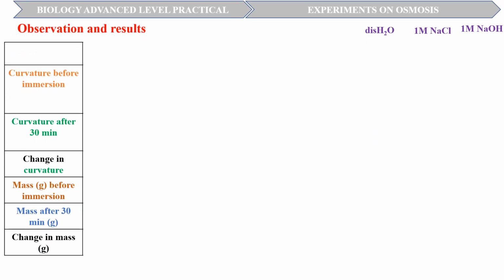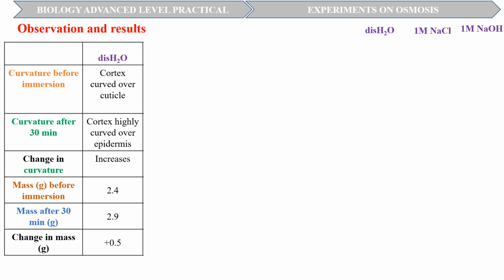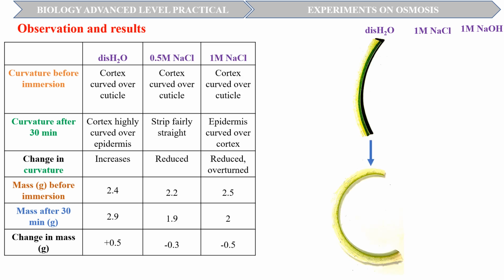The results of the experiment are presented as shown on the table. We saw an increase in curvature of the strip put in distilled water, that is, the hypotonic solution. The mass of the strip also increased.